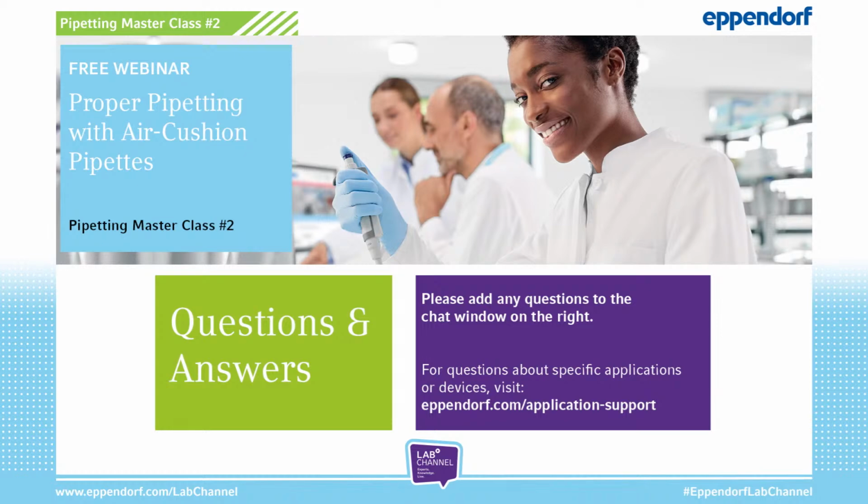Thank you for this, because this is a question we received during the last months quite often. And you can leave the volume as it is. When you're finished with your pipetting steps, you can leave the volume as it is and can store it. So there's no need to store pipettes at their nominal volume, so with the highest volume of the pipette. Quite easy. Just let it like it is.